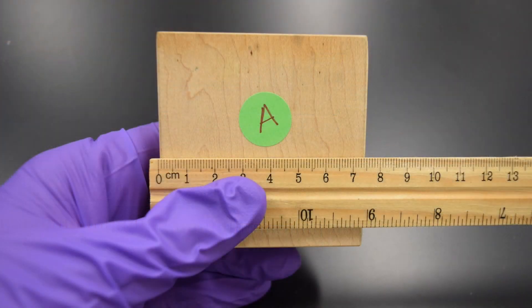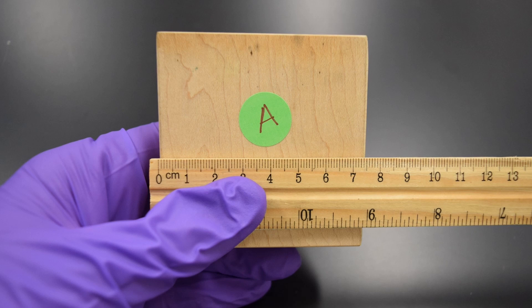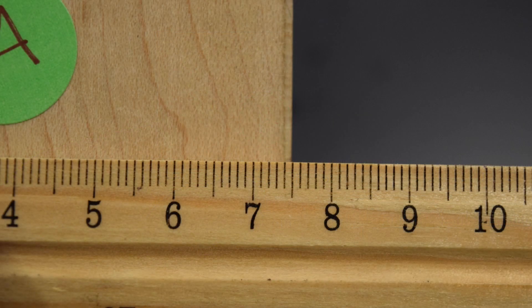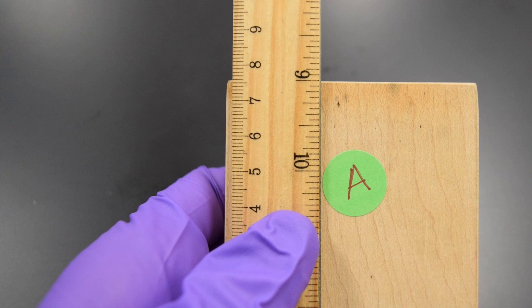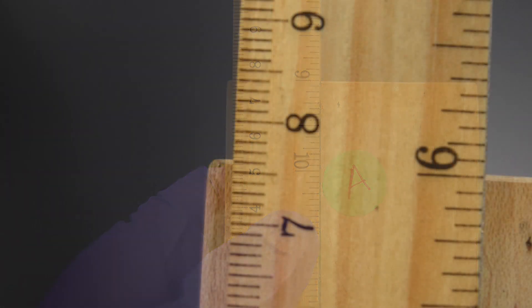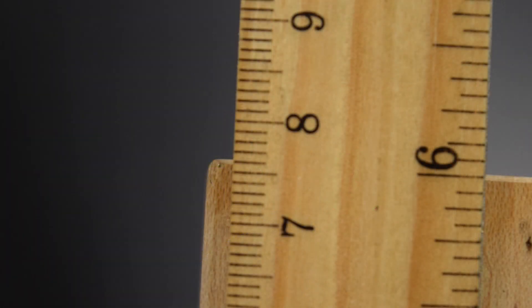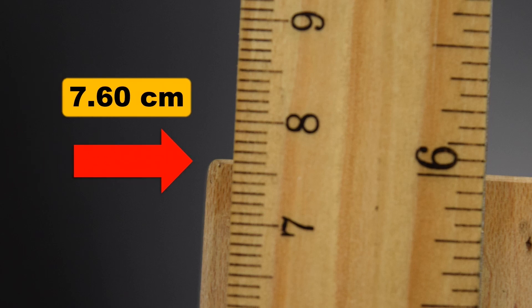For the regularly shaped wooden block, we'll measure the volume using the dimensions, length times width times height. Reading the centimeter scale on the ruler is essentially identical to reading the triple beam balance. Each centimeter is divided into tenths. I'll read each tenth, then estimate the second decimal place.